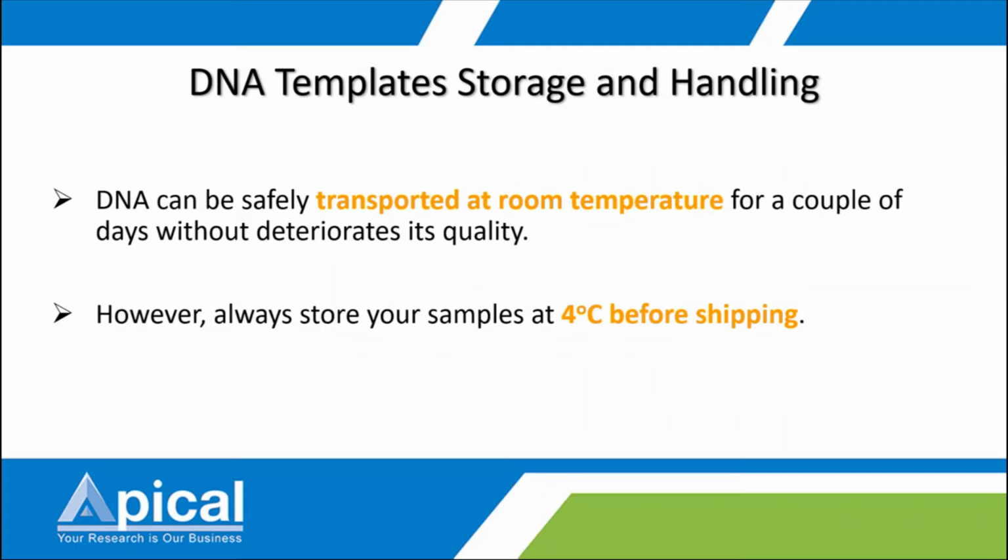Once your sample is ready, you may store it at 4 degrees before shipping, or before we come to collect your sample. This is suitable if you are going to store the sample for a couple of days, within 1 week. But if you're going to store your sample for more than 1 week, it's better to store at -20 until shipment.